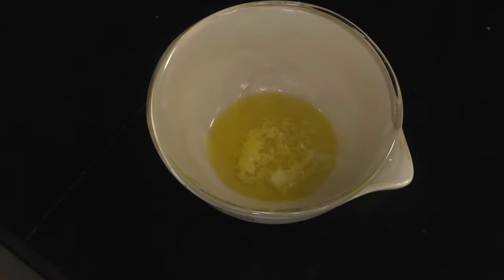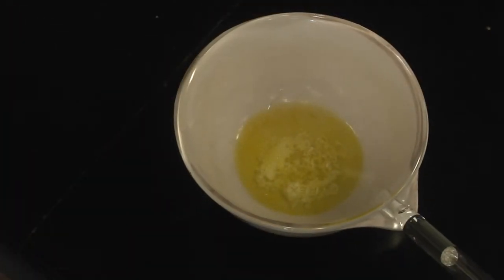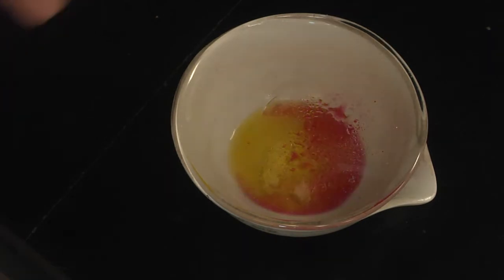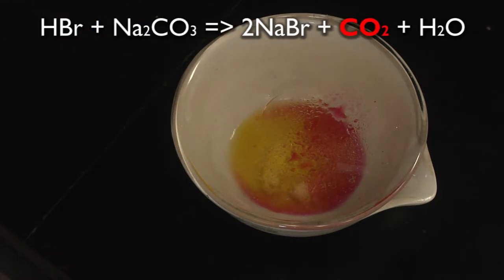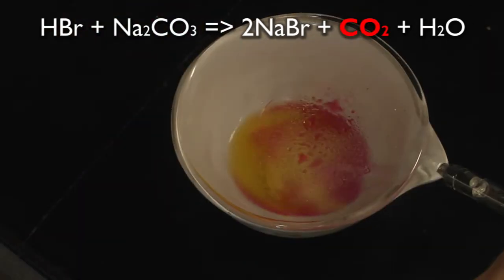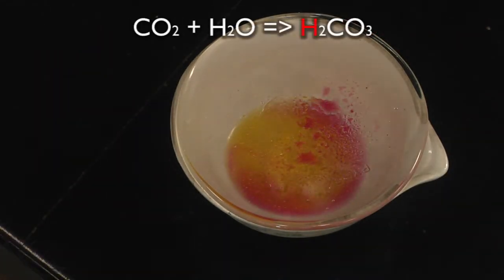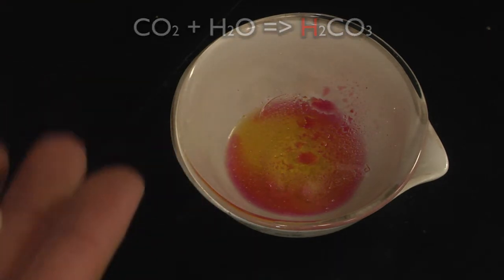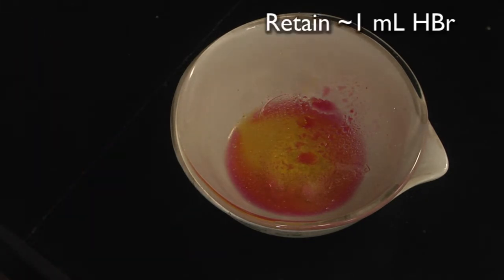Cover the casserole to catch any material that may spatter. Using an eyedropper, we're going to add the hydrobromic acid through the spout. Leave the watch glass on to catch any spattering that occurs. The carbon dioxide will actually give a false reading of pH, since CO2 makes water more acidic via this reaction. So we don't want to use all of our hydrobromic acid because of this false reading — retain approximately one milliliter of your acid.